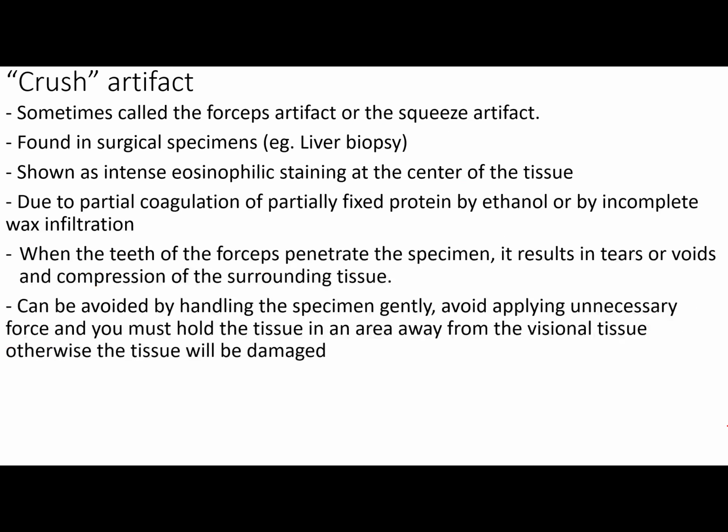Then the last one, there's the so-called crush artifact, sometimes called the forceps artifact or the squeeze artifact, found in surgical specimens, class, such as liver biopsy. It shows an intense eosinophilic staining at the center of the tissue. This is due to partial coagulation of partially fixed protein by ethanol or by incomplete wax infiltration. So nangyayari itong crush artifact na to, class, if there is partially fixed protein or incomplete wax infiltration. So hindi na-infiltrate ng wax, class, yung buong tissue. Crush artifacts could be formed.